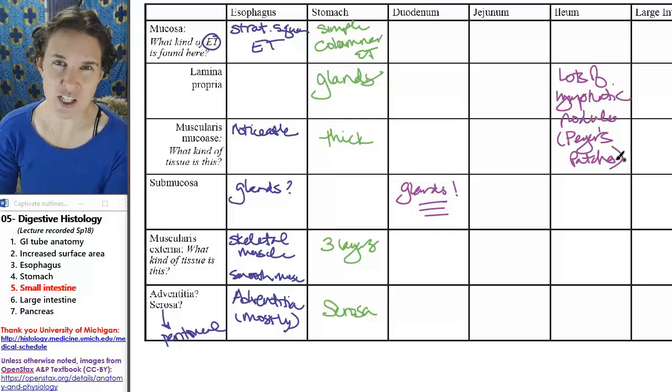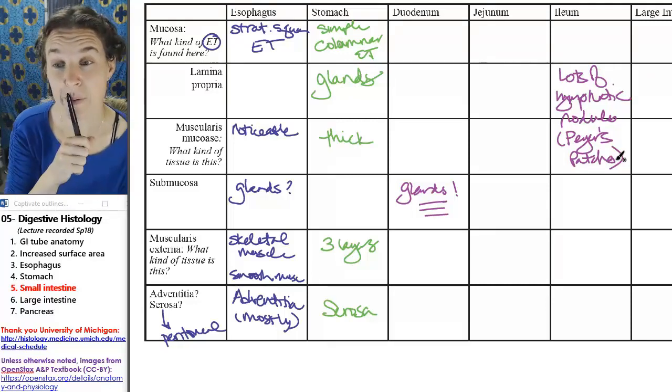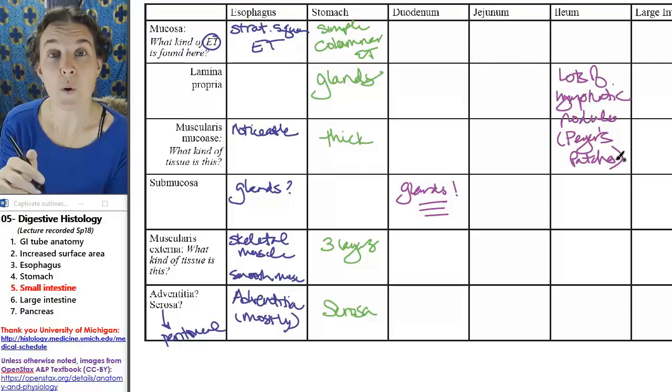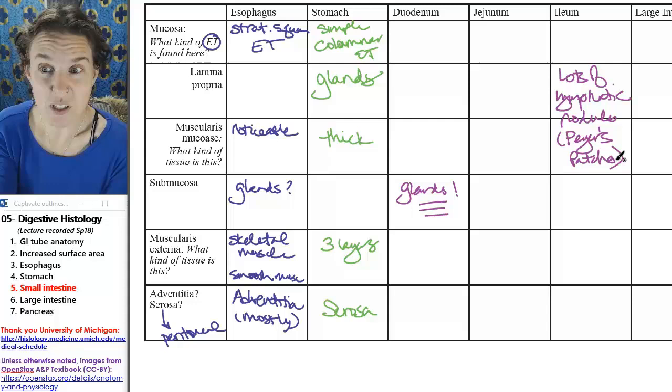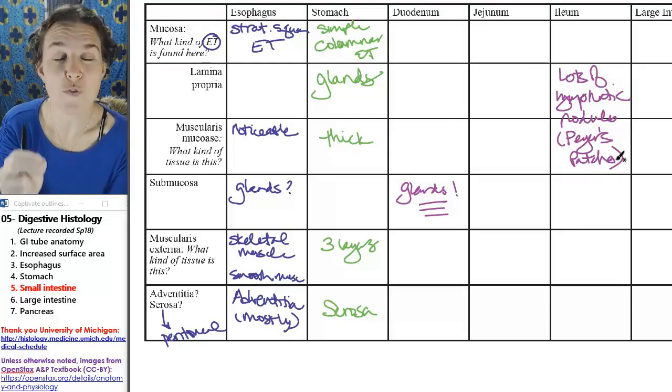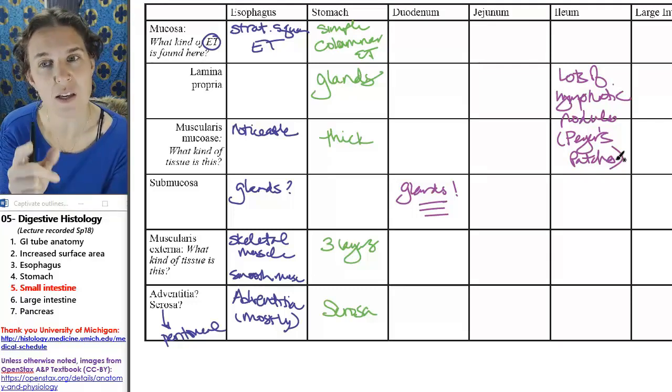Sometimes the large intestine also has lots of lymphatic nodules. Well, we'll save the large intestine for the next one. So look for lots of lymphatic nodules—you're in the ileum. Look for crazy amounts of glands in the submucosa—you're in the duodenum.